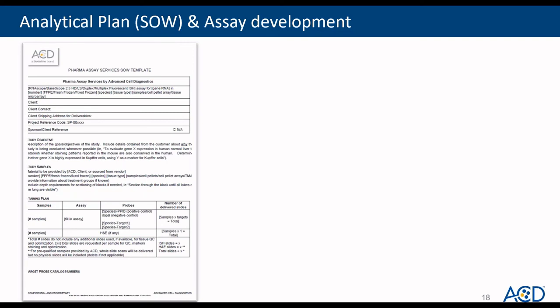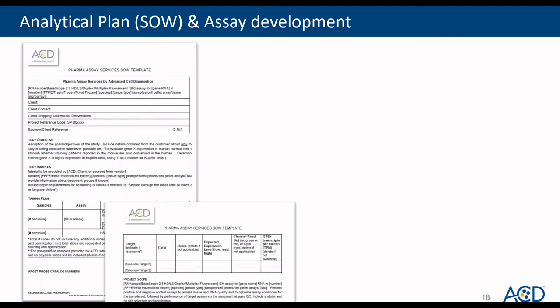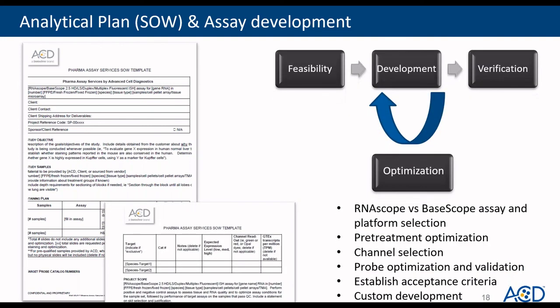This slide illustrates a SOW or analytical plan and assay development. Here on the left, you see a Pharma Assay Services SOW template. Assay development would include choosing an assay platform. It might include optimization steps for sample pre-treatment and probe optimization and acceptance criteria.